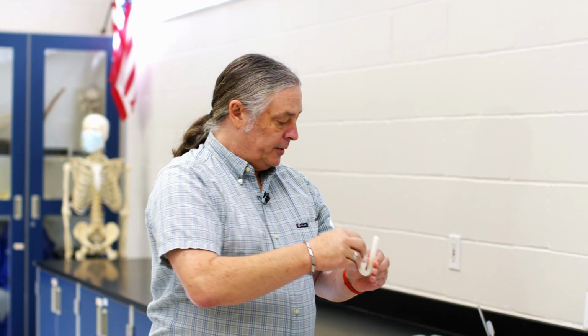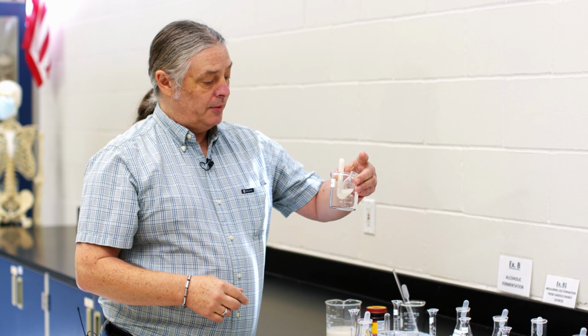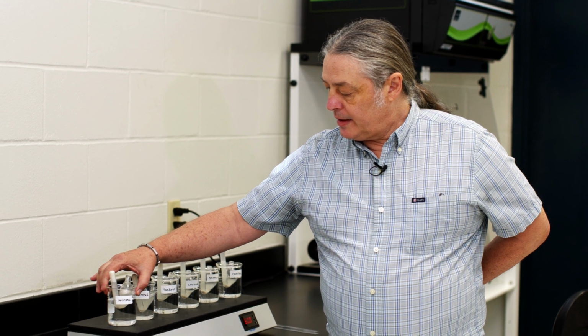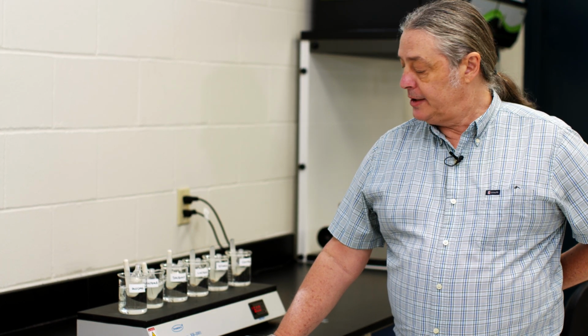And we're going to use beakers to hold these tubes because they won't stand up on their own on a tabletop. And we're also going to add a little bit of warm water, kind of like a little warm bath for the setup here, and then we'll give them a chance to go to work. Okay, so once you have your fermentation tubes all loaded and placed in the beakers with a little bit of a water bath, we're going to allow the yeast a portion of time to go to work on that molecule that you've given them to try to use for fermentation.